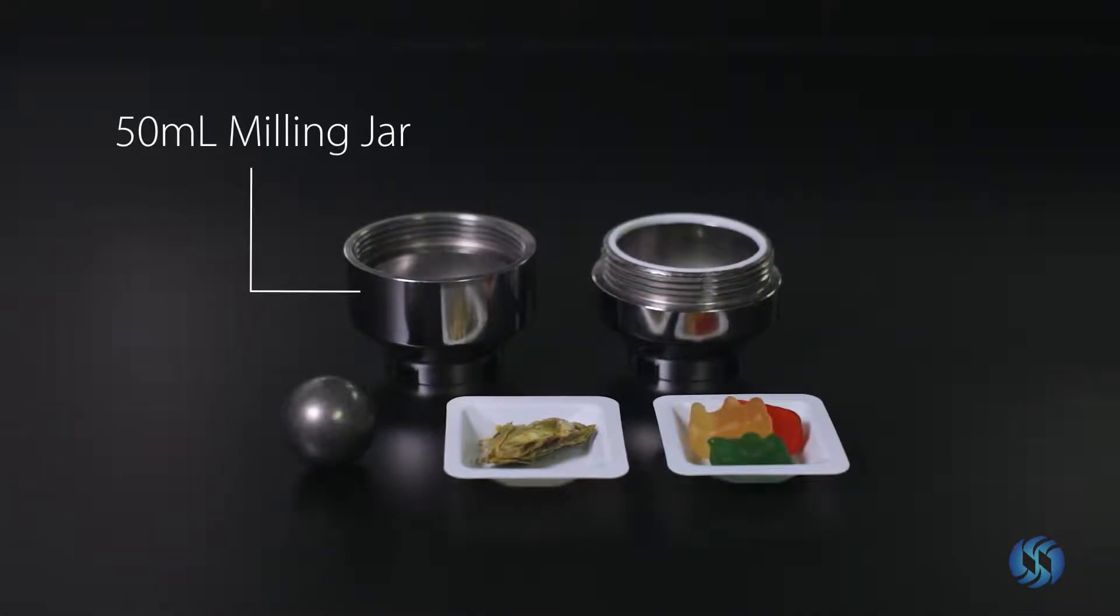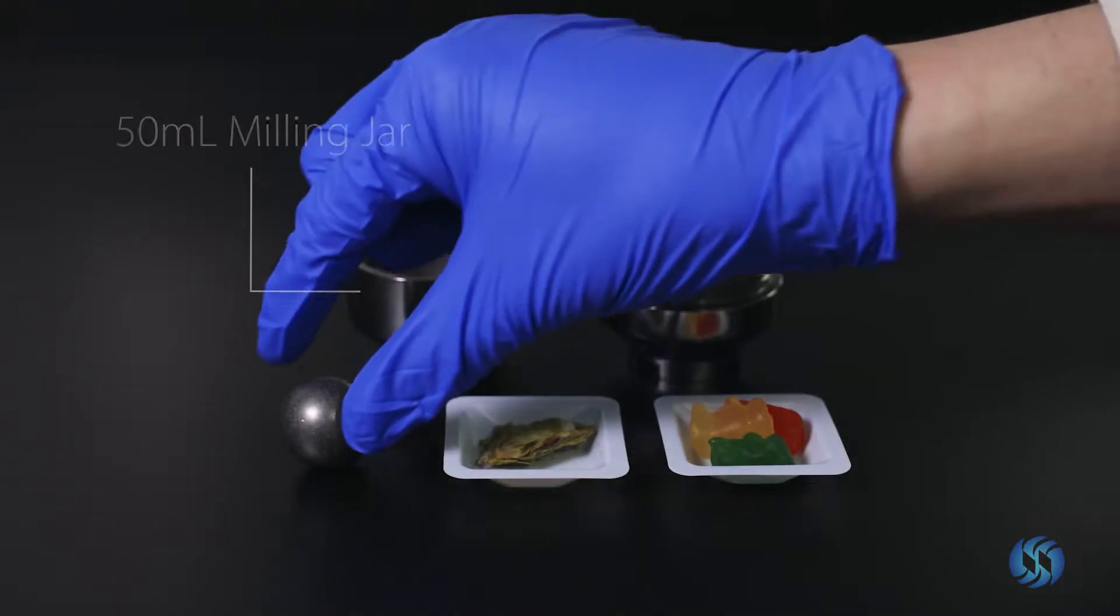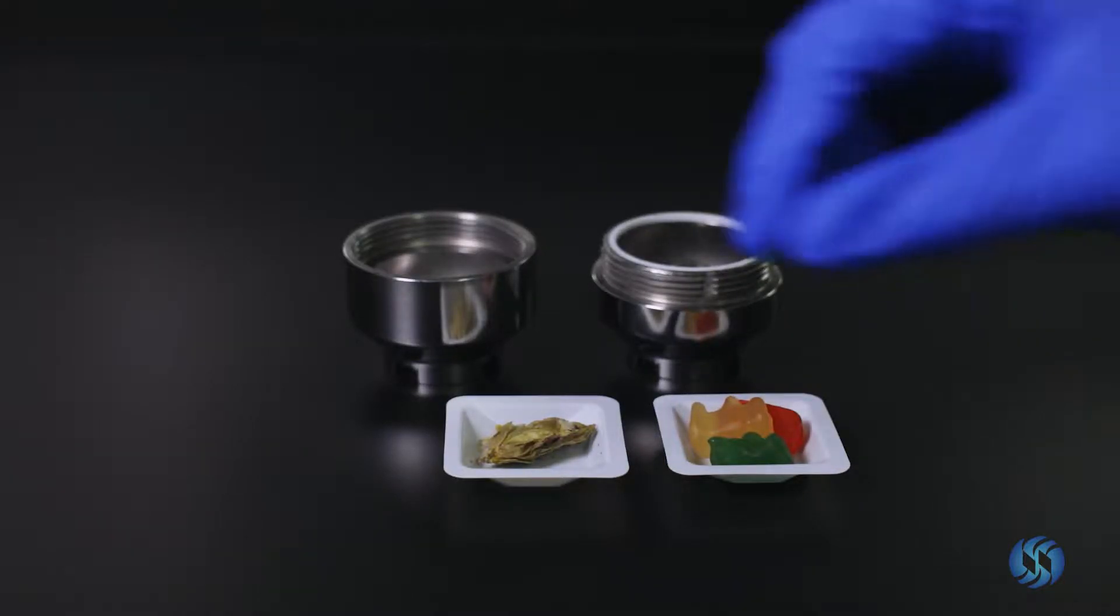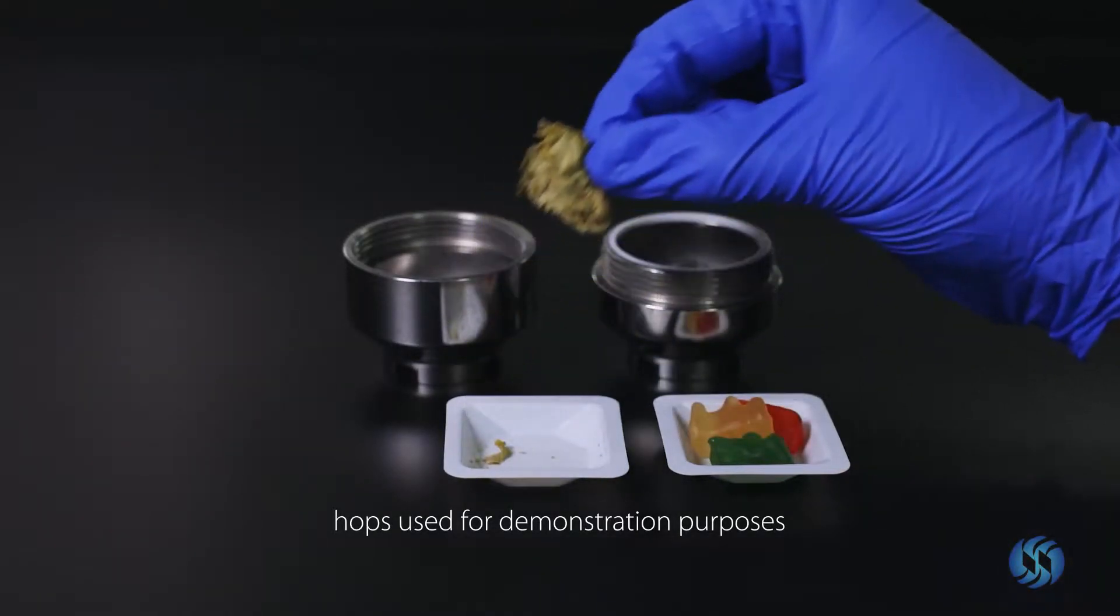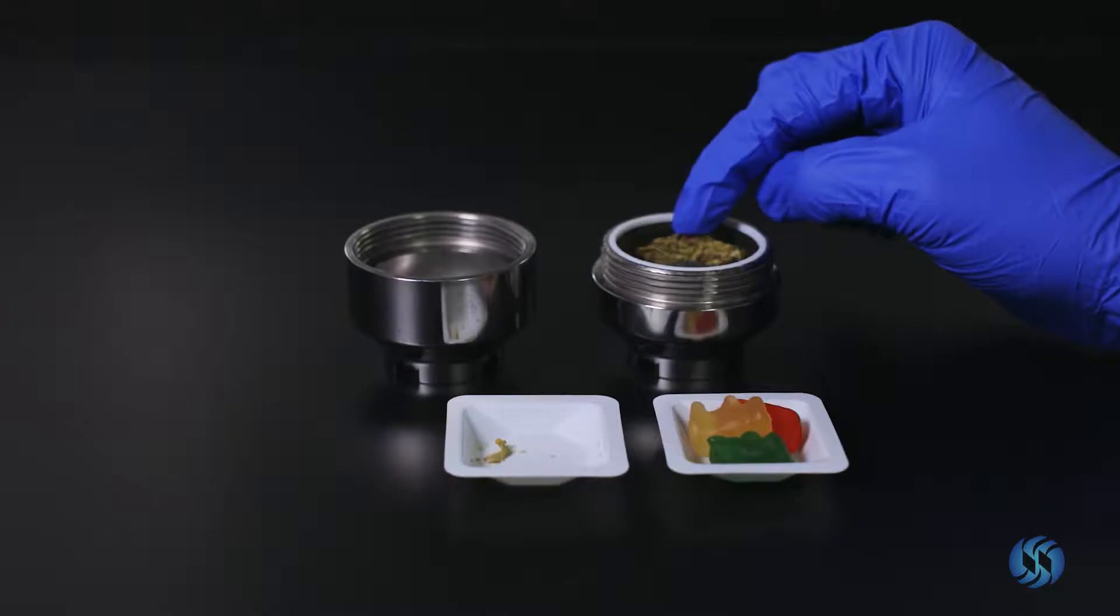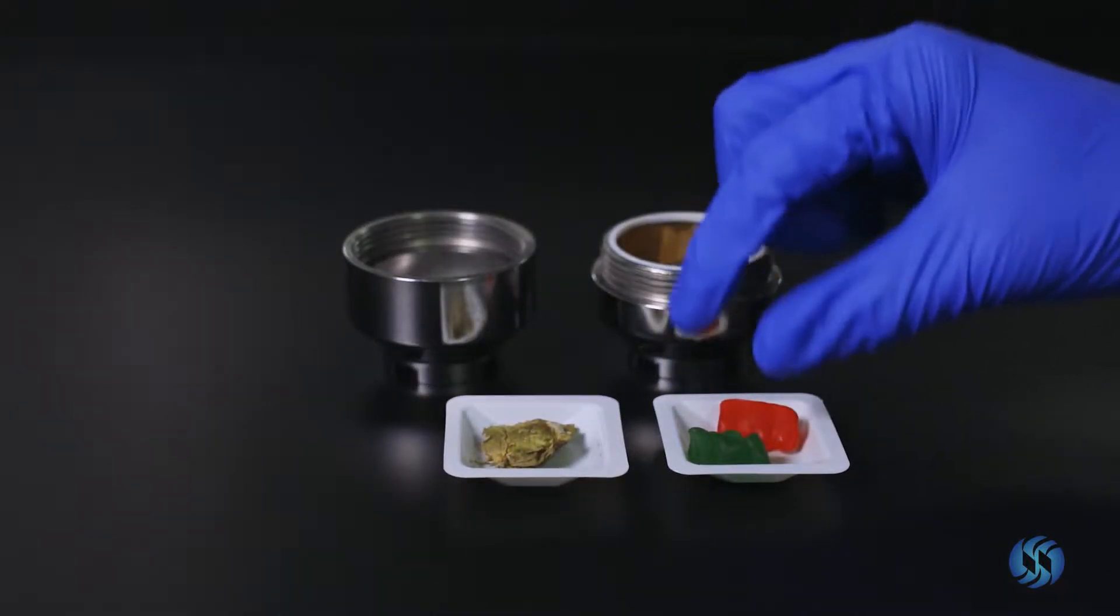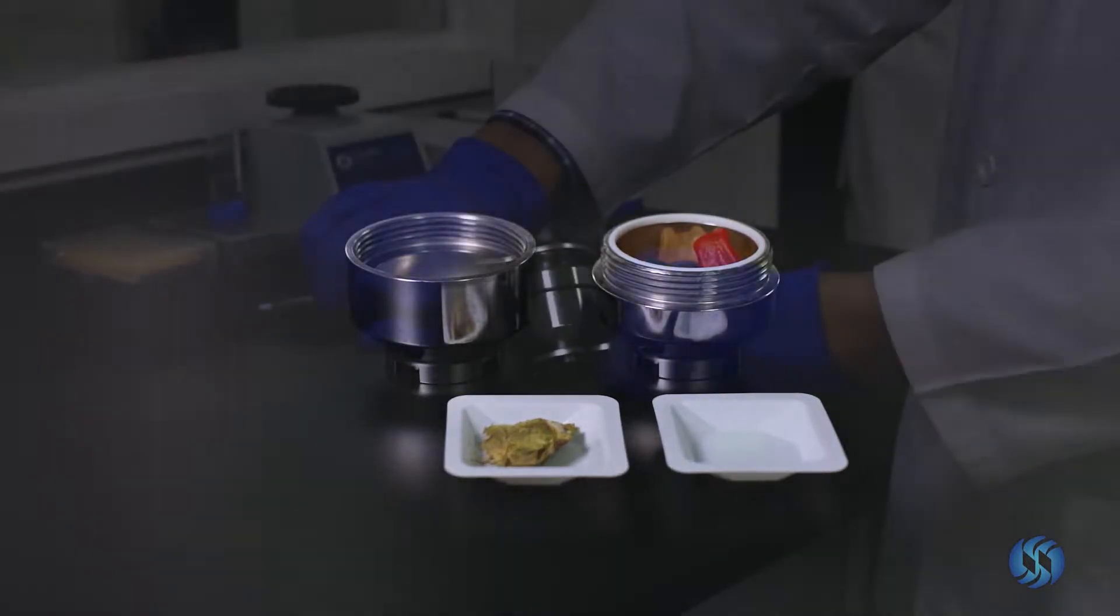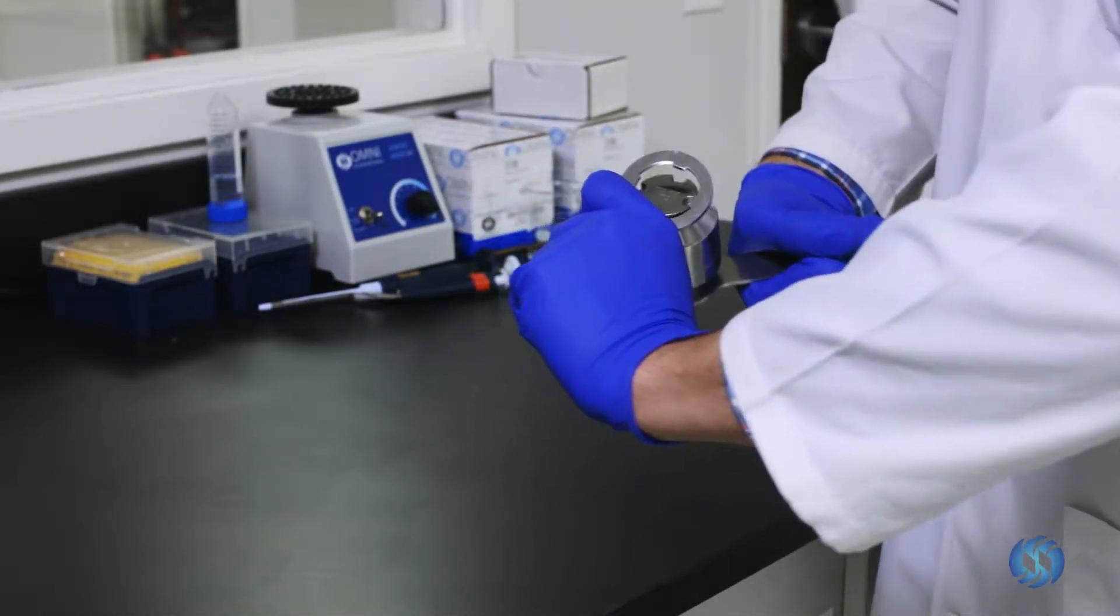Prepare a 50 milliliter stainless steel milling jar with a 25 millimeter milling ball. Place your sample into the milling jar. Ensure that the milling jar is tightly sealed before proceeding.